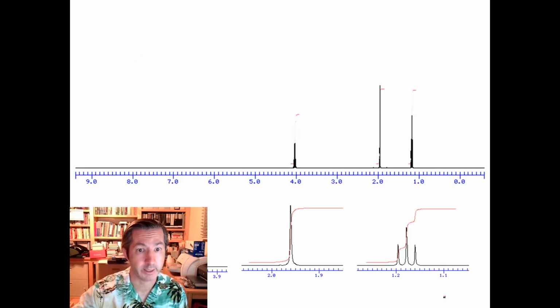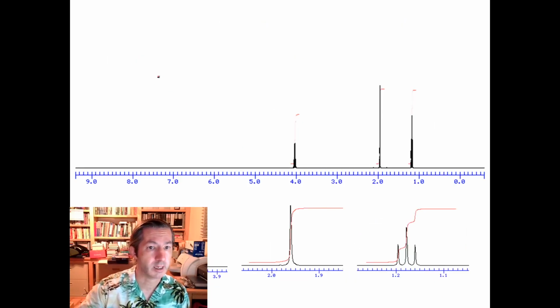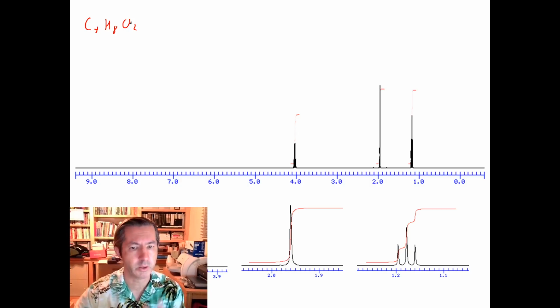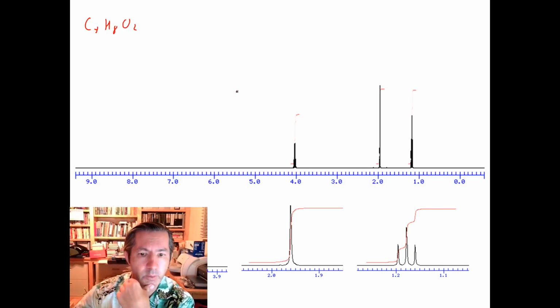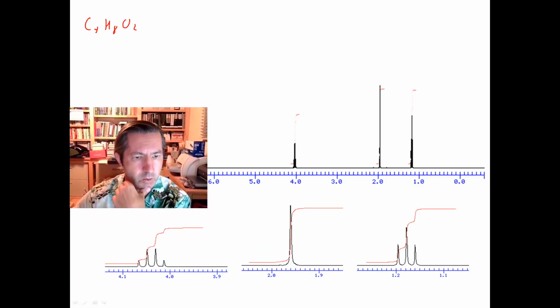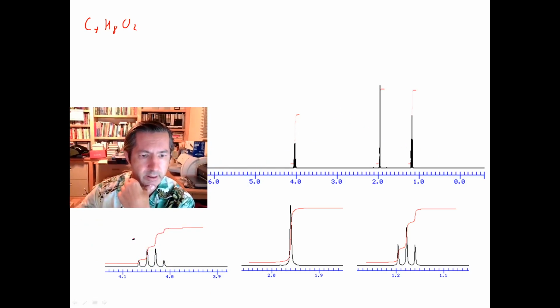And this time with this compound, this will be C4H8O2. This is going to be a similar compound. I'm not making this one too different. Again, we have 3 signals. There we go. And again, we've got a quartet right here. We have a singlet. We have a triplet. And we actually have the same integration going on.